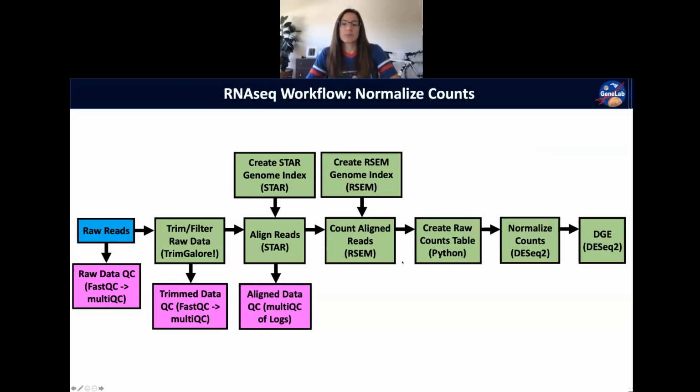So this, guys, is pretty much the end of data processing. This part of the pipeline, up until you get that counts table, is what people consider the data processing portion. Now we have a counts table that we could start playing around with and analyzing however we see fit. So this portion from here on out is considered analysis, analyzing the data that we just processed. The first step in our analysis is going to be to normalize our counts data.